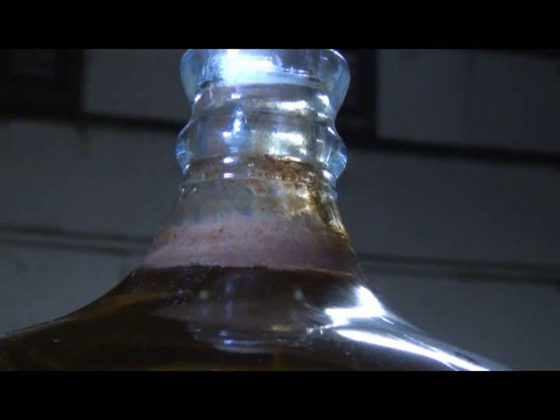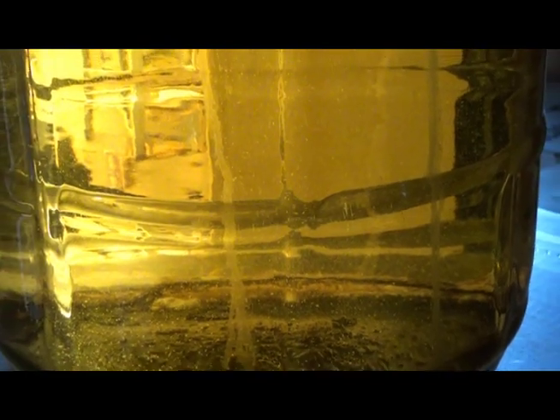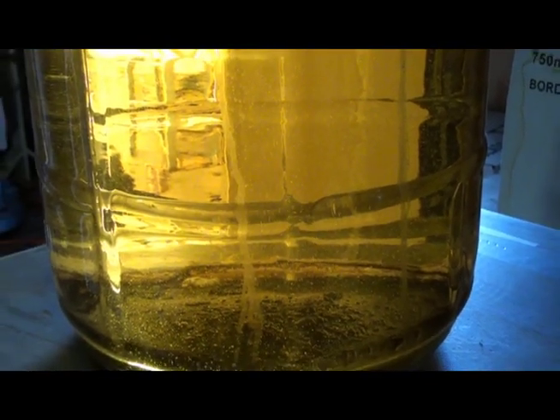Therefore, SO2 acts as an antimicrobial and an antioxidant for our wines. Too much SO2 can impact aging undesirably, reduce fruit aromas, and negatively impact the sensory profile of the wine.